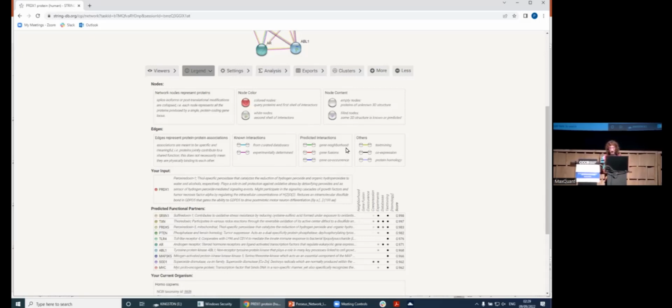And then we have predicted interactions as well. And then others, like these, are further information. For example, if these two proteins are usually co-expressed together, they might be interacting, but they also might not. And for the predicted interactions, these were found for different reasons.